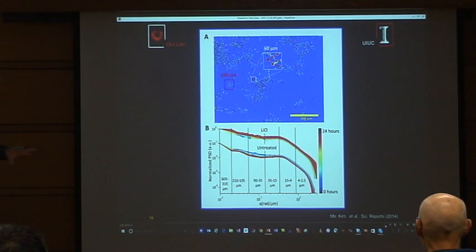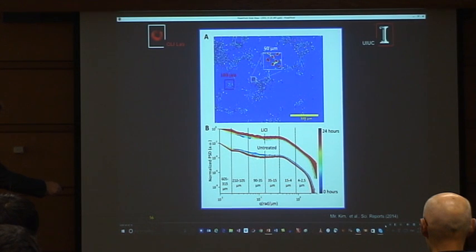So large correlation means narrow power spectrum, right? You notice from 0 to 24 hours, the power spectrum gets consistently narrower and narrower. It's also very interesting that it's in this intermediate spatial frequency range, not at the high frequency. This is the range corresponding to the cell size.